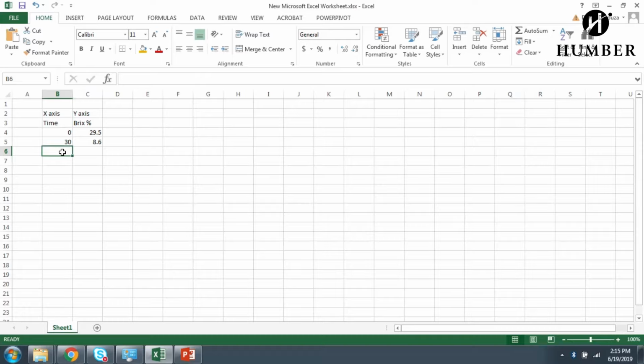The forced equilibrium is the time which is needed, however we got the Brix percentage value at 1.0. So basically, to get equilibrium, we got the value of equilibrium to be 1% Brix. We need to determine what time it would have taken for that to have occurred.